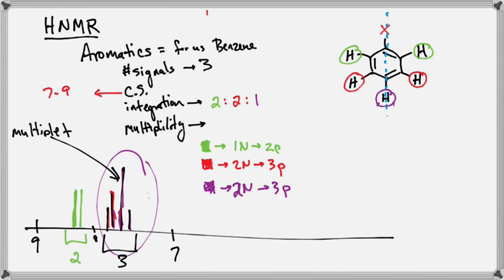Okay? That evidence should backfeed to verify you've got a correct structure. If you go through and look at it and you're like, my final structure, I have no explanation for why two hydrogens should show up in the same place, that probably means you screwed up your interpretation. Kind of, sort of? Right?